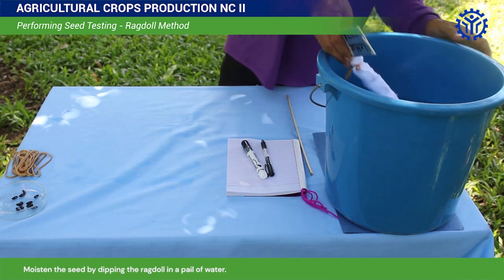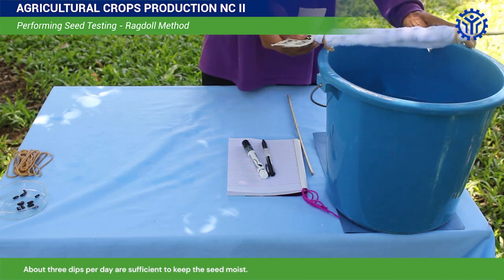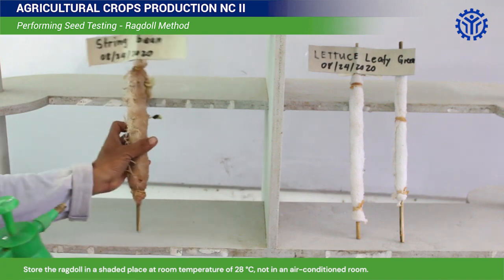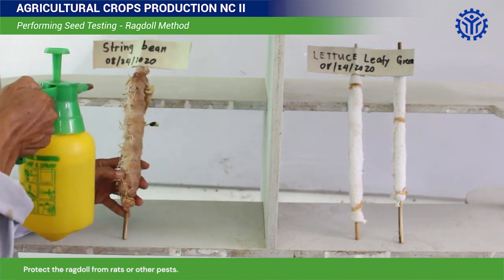Moisten the seeds by dipping the ragdoll in a pail of water. About 3 dips per day are sufficient to keep the seeds moist. Store the ragdoll in a shaded place at room temperature, and protect it from rats or other pests.